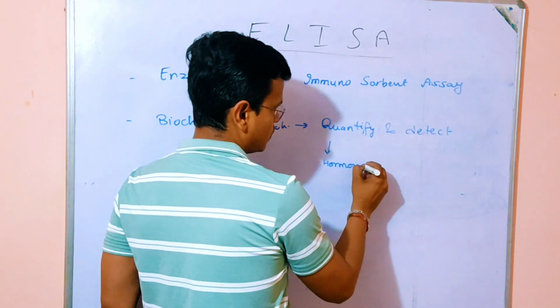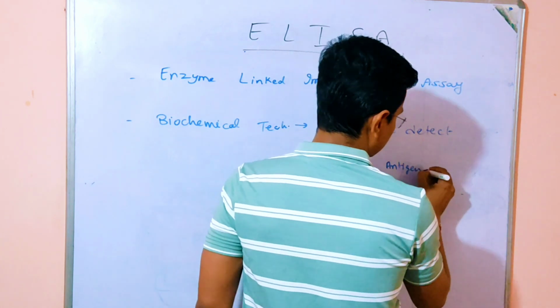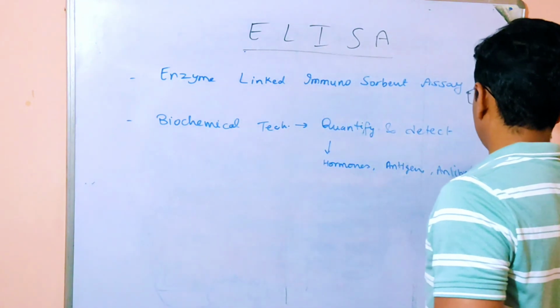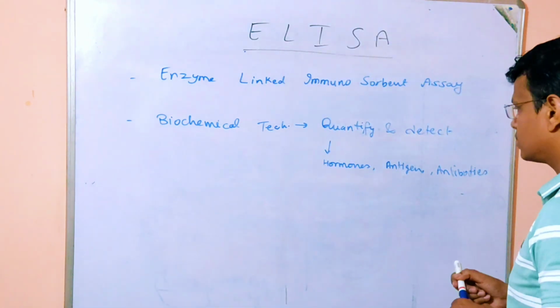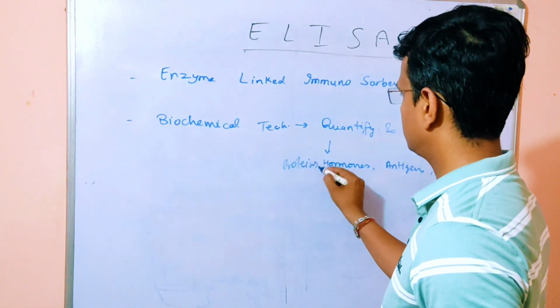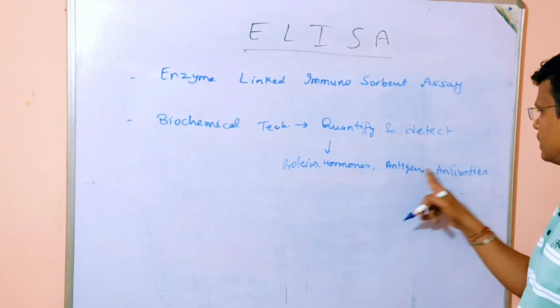Hormones, antigens, antibodies, and proteins. It is a biochemical technique used to quantify and detect protein, hormone, antigen, antibody.